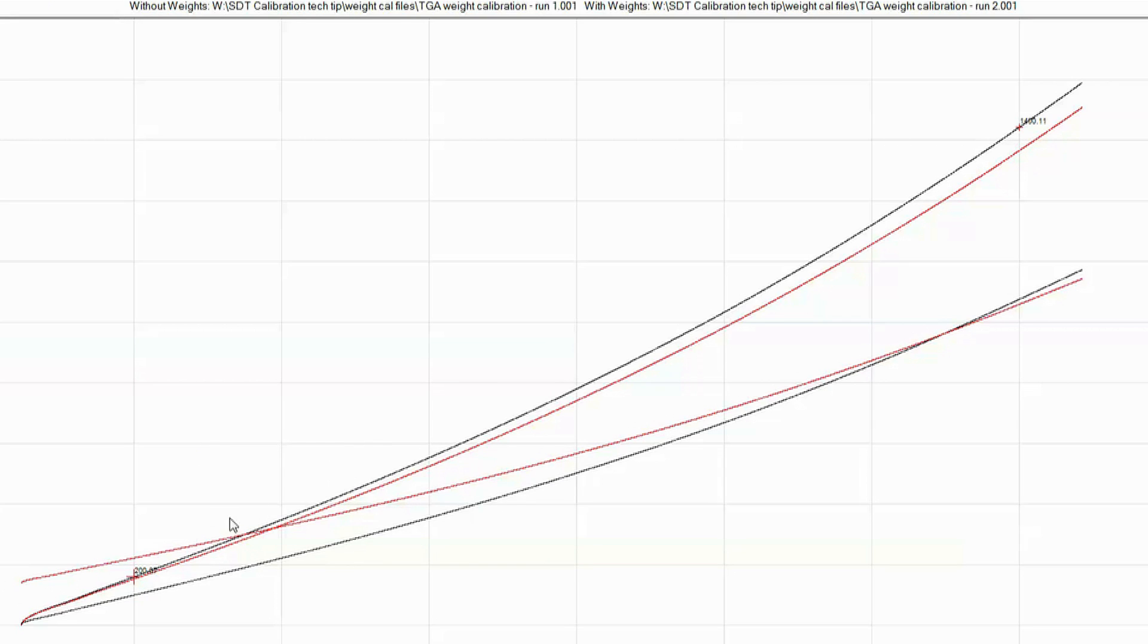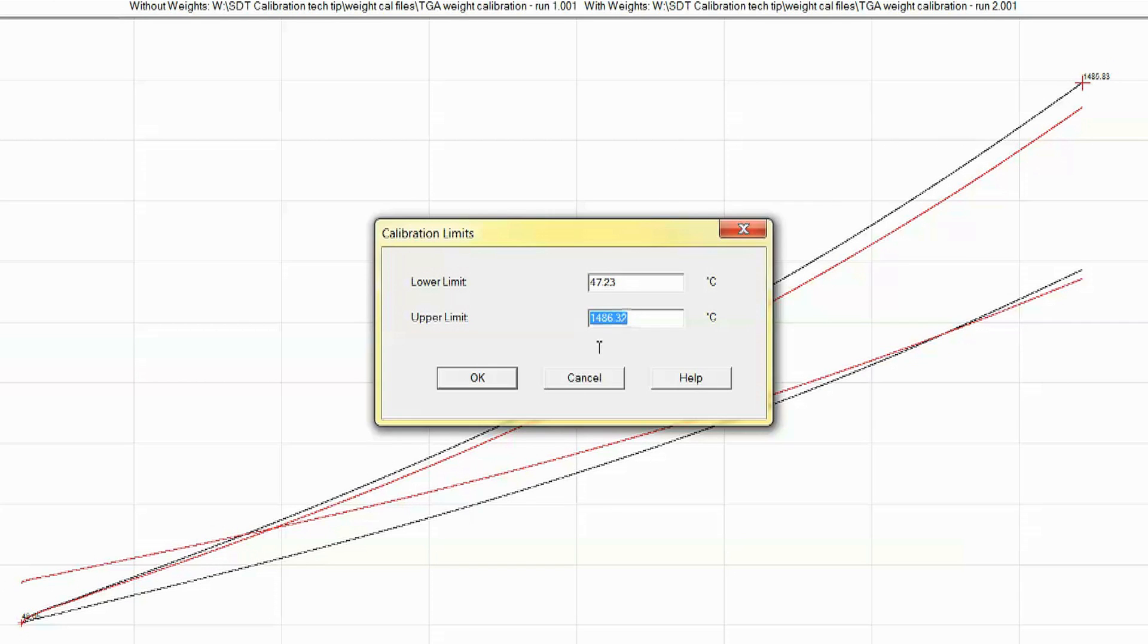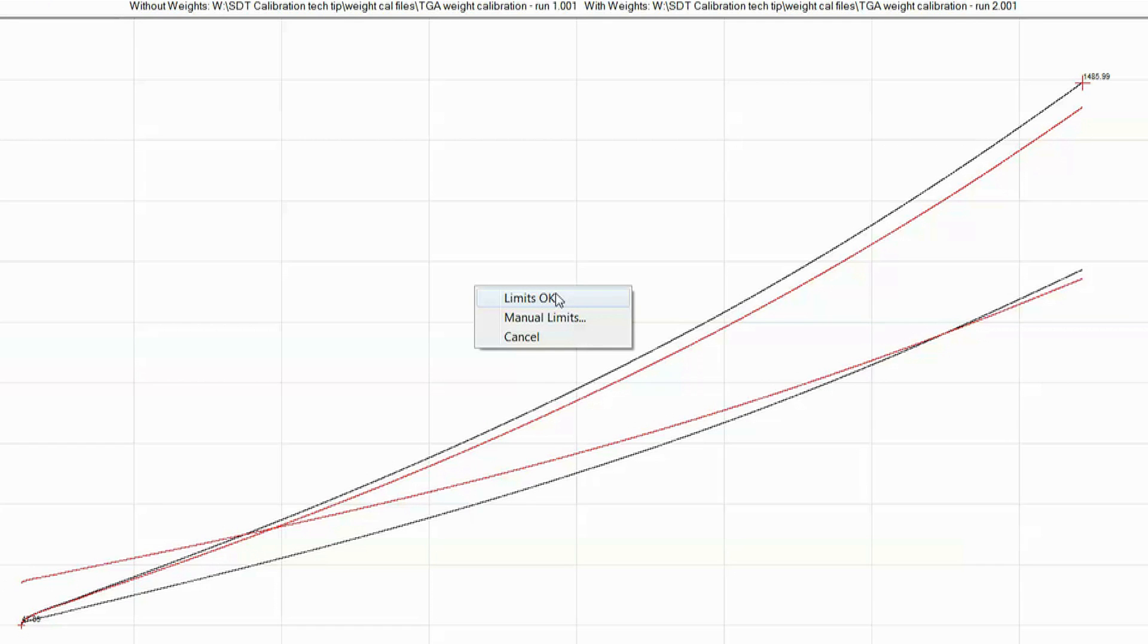You can either drag the cursors using your mouse or right click on the screen and enter the limits manually. Once the limits have been selected, right click on the screen and select limits. Okay.